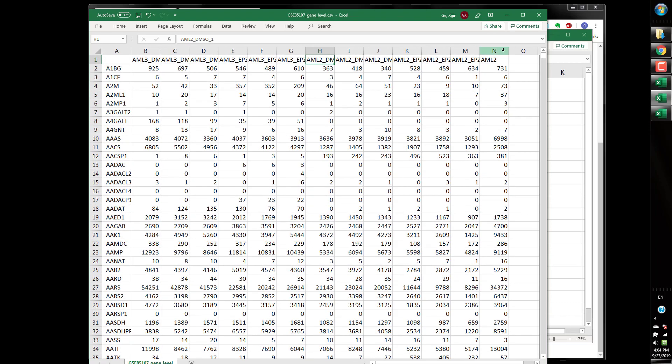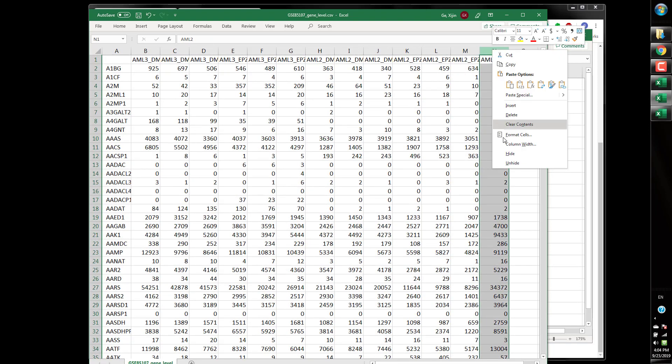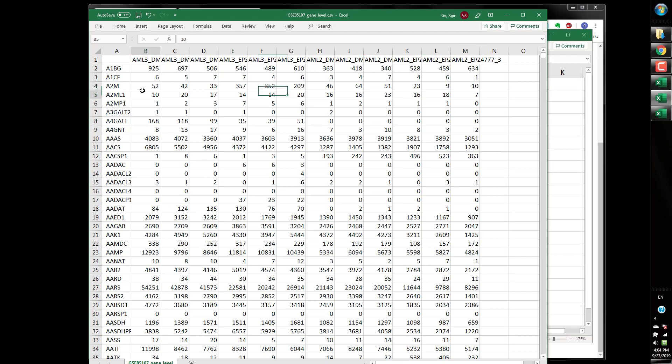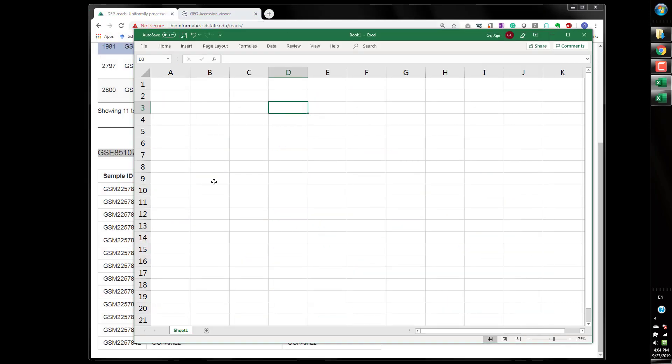And the last one we are going to delete I don't know this is a control or something but there's no replicates so I save that and this is good to go.